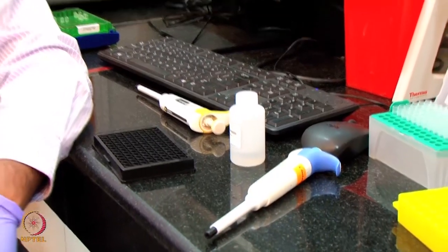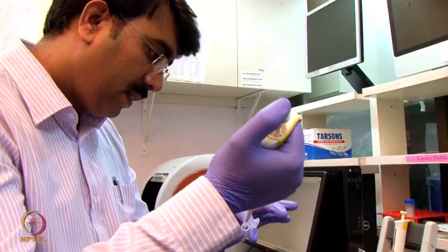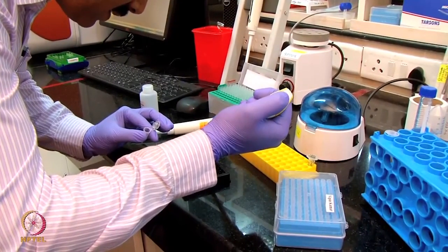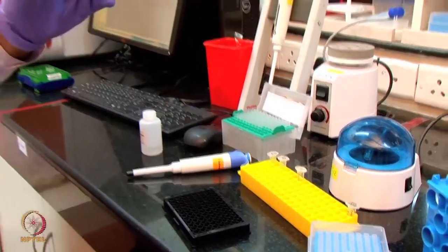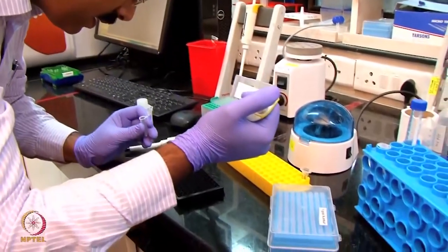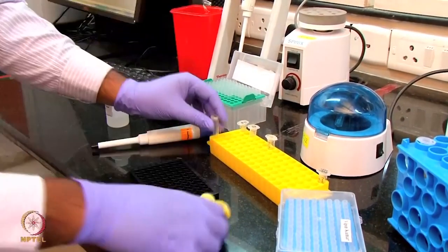So these 3 unknown proteins, we are going to determine the concentration of the unknown apolipoprotein in the samples using the standard. Now I am going to add the 3 unknown samples here. I am going to place at B3 sample number 1, at B4 sample number 2, and at B5 sample number 3. So there are 3 unknown samples.